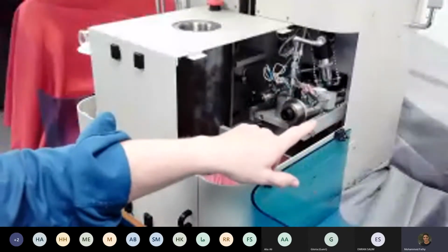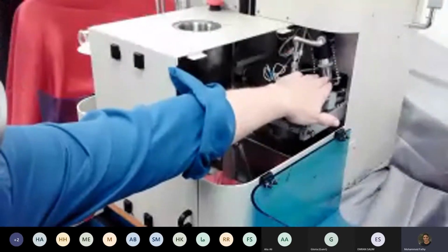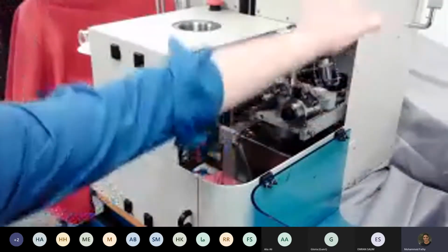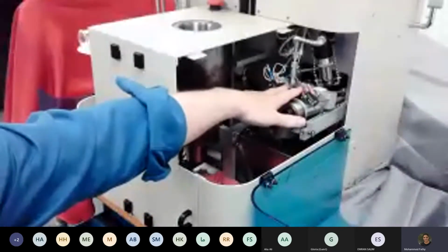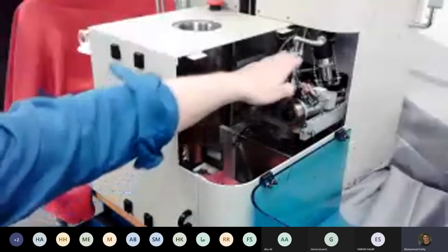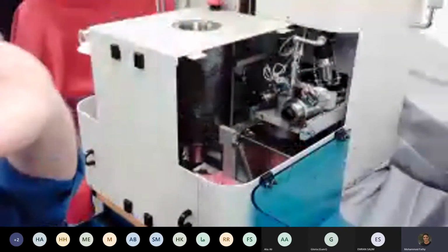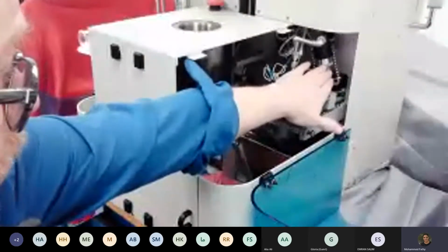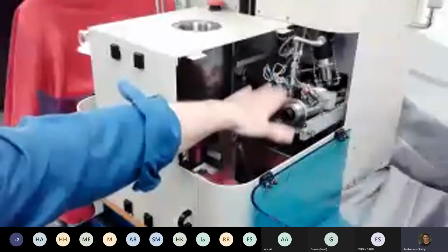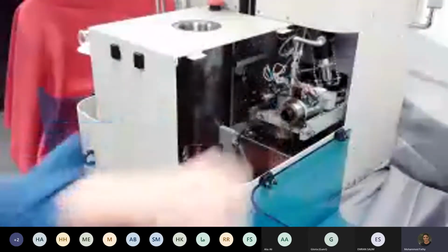Also on this view here, this is a mercury overfill sensor. We are pulling vacuum on the system, and mercury is filled up to this level. And this is an overfill sensor which stops mercury going any further than this point. This is not the normal fill level. The normal fill level here is set here, but this is a low pressure system.